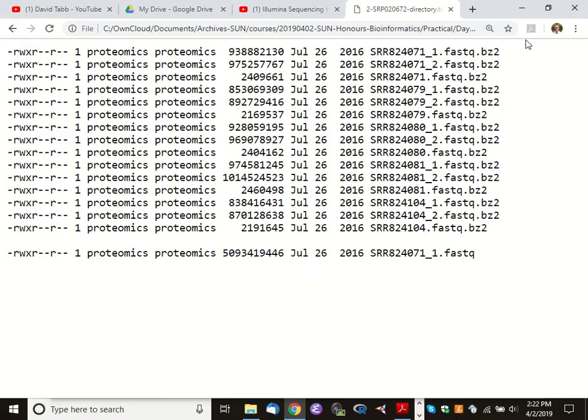Now I would further point out that these data came from a publication in the year 2014. What does that tell us about the sequencer used for this experiment? That would be 5 years ago. The technical term is obsolete. Sequencing technology moves incredibly quickly. As a result, if you're dealing with an instrument from 3 years back, you're probably dealing with something that's very much the last generation. So if you had subjected these same samples to the NextSeq 500 over at CPGR, which is not a current instrument either, you would produce files that are much bigger than this.